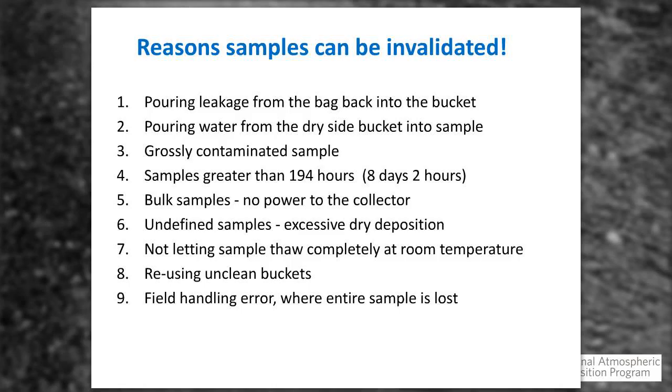Number three, grossly contaminated samples. We talk about bird droppings. One thing that we try to point out when you inspect your bucket for the first time is to make note of what you see in there, because after the travel to and from the site, the stirring and mixing and the bumps and everything that may cause that sample to break down, what you saw in there initially may not be there when you get back to the sample, because it may have broken down. So please make note of that initially.